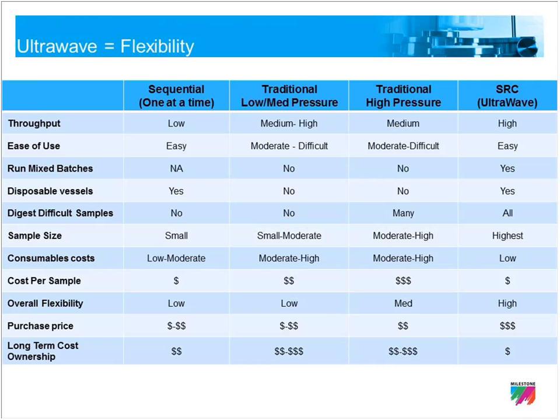So I'm just going to finish up here real quick, last slide, on talking through the different systems that are out there today in terms of microwave digestion. And this isn't specific to vendor, it's just the types of microwaves that are available.